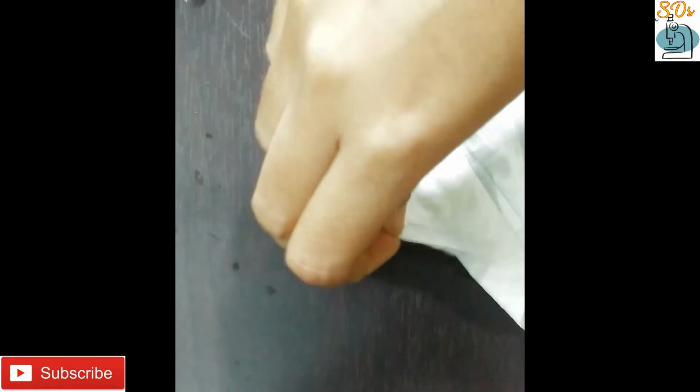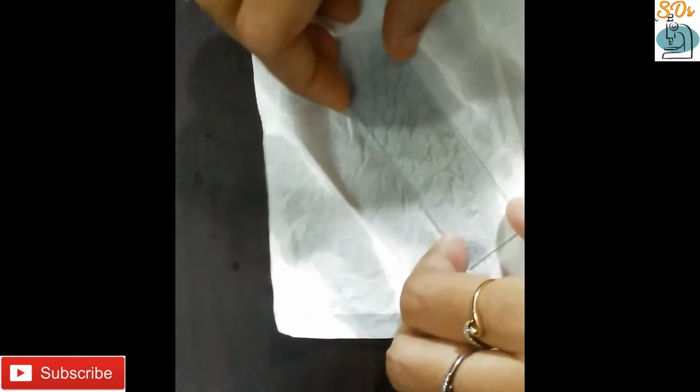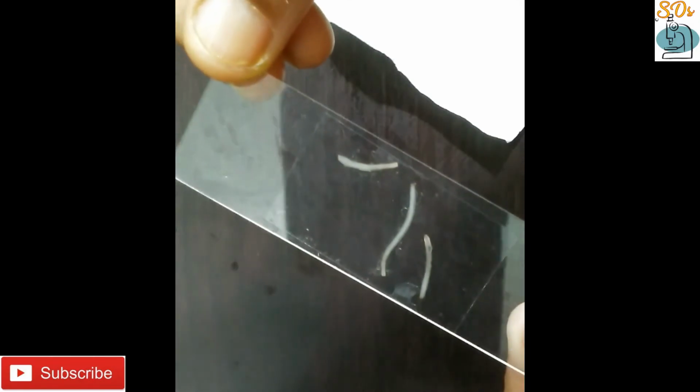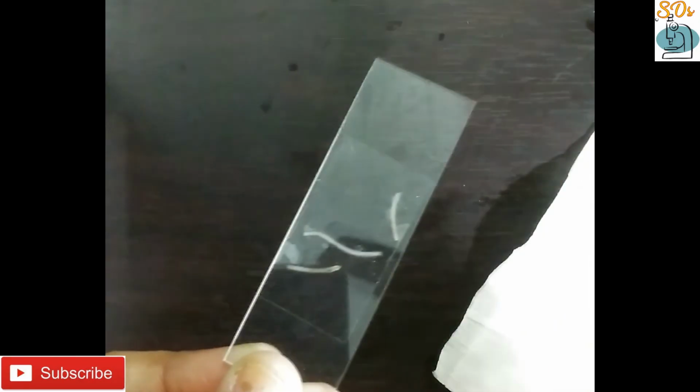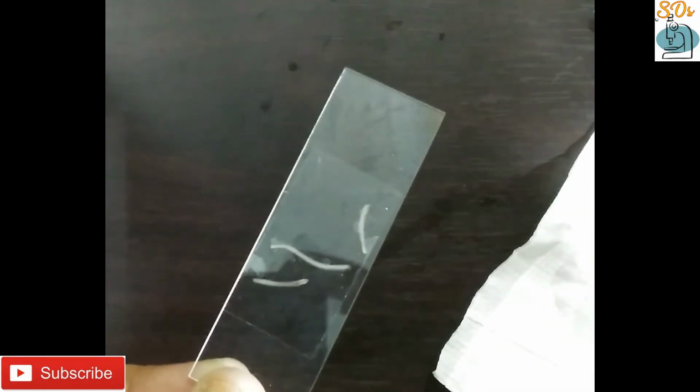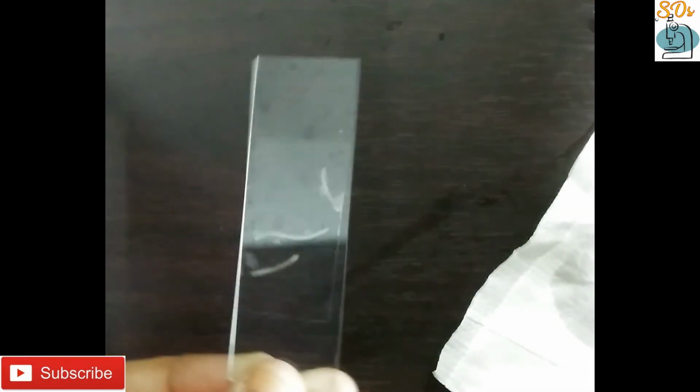This will help the root tip present under the cover slip to be squashed properly and to be straightened out as fine cell layers. Now the onion root tip cell slide is prepared and ready to be examined for different stages of mitosis.